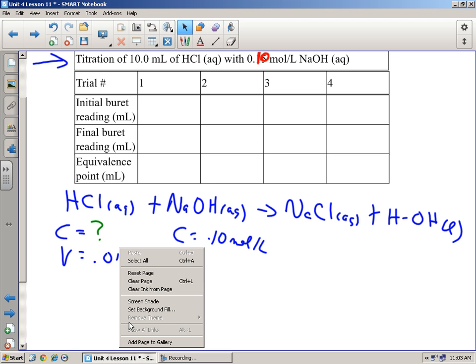Okay, and if you don't, well, as long as you're consistently bad, then that's all that matters. Okay, I don't know how else to say it. But this is too dark. We're looking for something, I'll kind of show you tomorrow. Hopefully, we're looking for that clear color with a slight hue of pink. Okay. So, too dark, but that's okay. All right. Go sit down for a sec.